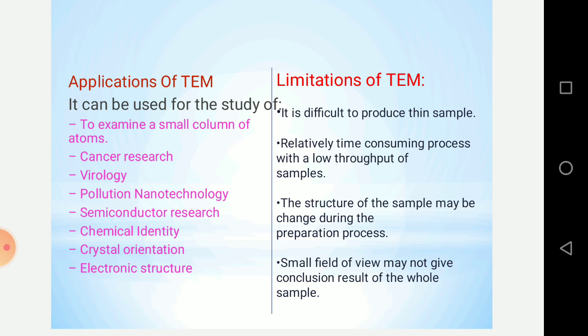Semiconductor research: you must have used a semiconductor in your 12th physics lab. So to develop that semiconductor, we make use of a microscope, that is, the transmission electron microscope.